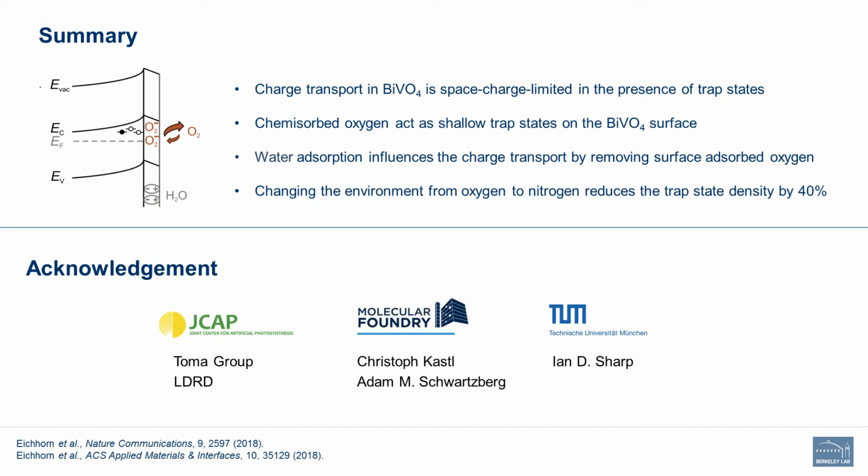We had a mass flow controller to control the flow rate, and we had oxygen and humidity sensors inside to constantly read out our level of oxygen and humidity in the hood. However, this is why we were limited in the humidity level we could use for our measurements, since we cannot go higher than 50% humidity, otherwise there's a chance that we will damage our scan head.